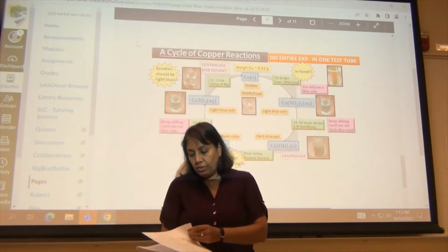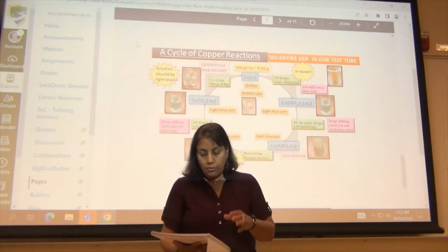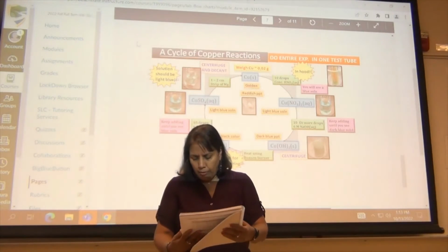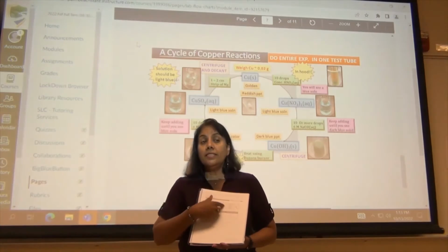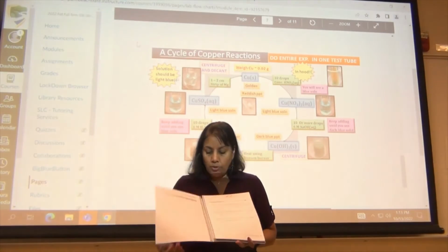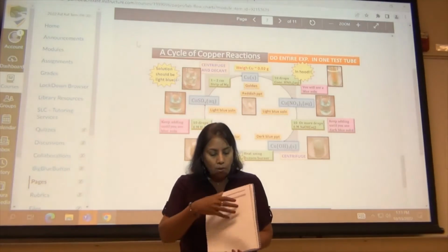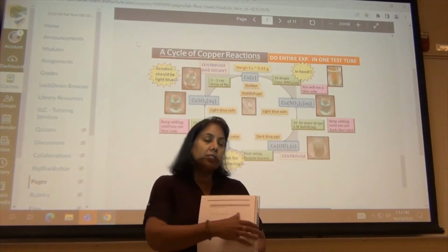So what you're going to do in this one: you'll have the pre-lab and all that good stuff. But for page 83, you're not going to do page 83 at all, because this is the weights part. So we're not doing any of the weights. You're going to go to the next page, which has all the observations in it. Let me explain what you need for observations here.